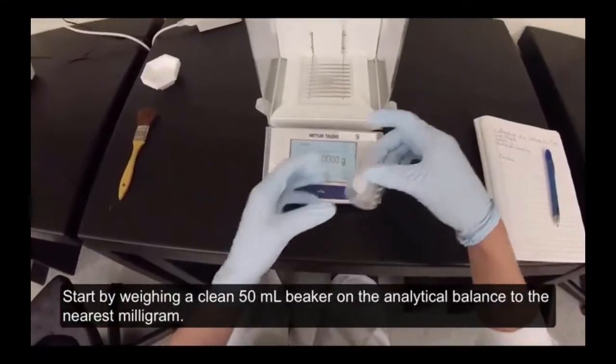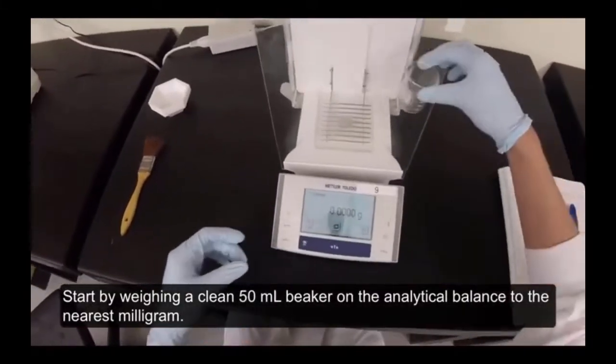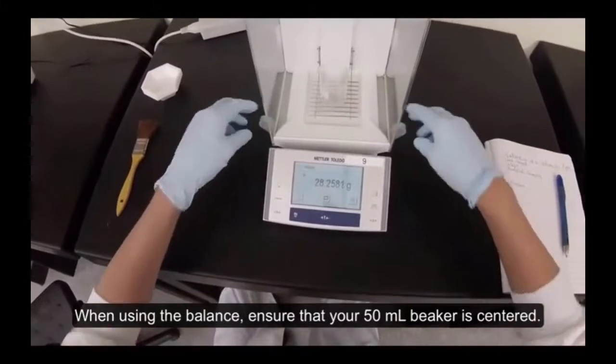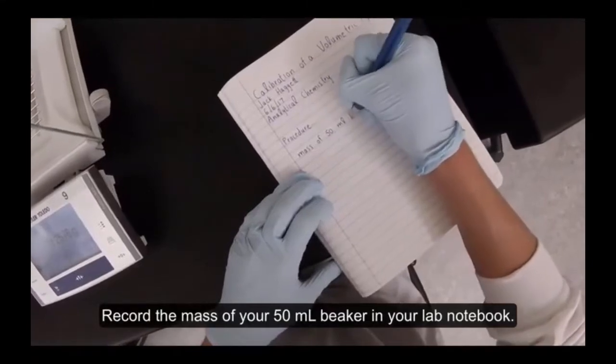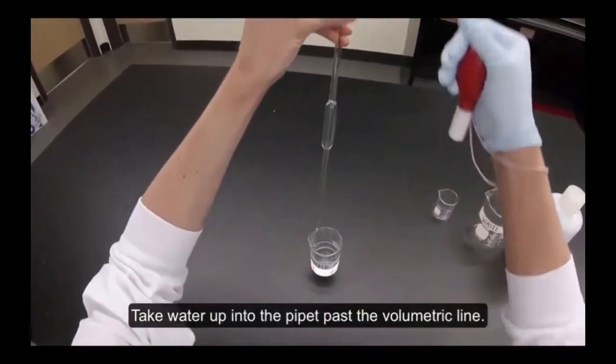Start by weighing a clean 50 milliliter beaker on the analytical balance to the nearest milligram. When using the balance, ensure that your 50 milliliter beaker is centered. Record the mass of your 50 milliliter beaker in your lab notebook. Take water up into the pipette past the volumetric line.